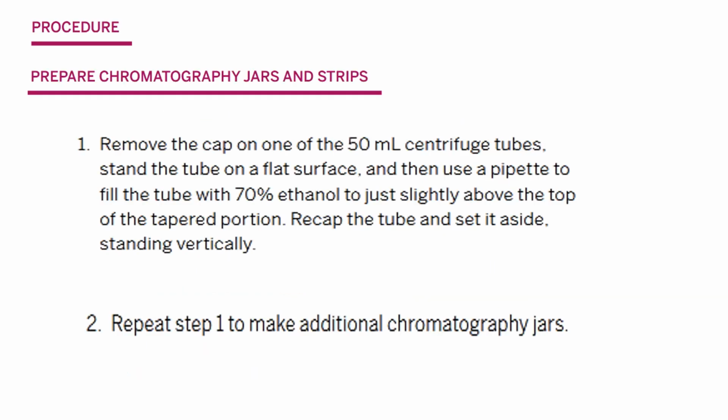So these are the materials needed for our practical. Now we'll move to the practical: how to prepare the chromatography jars and strips. First point: how to develop this? Developing a chromatography strip may take a few minutes to half an hour depending on temperature and other factors. To save time, we will prepare several chromatography jars in which we will develop all our chromatography strips at the same time, one strip per jar.